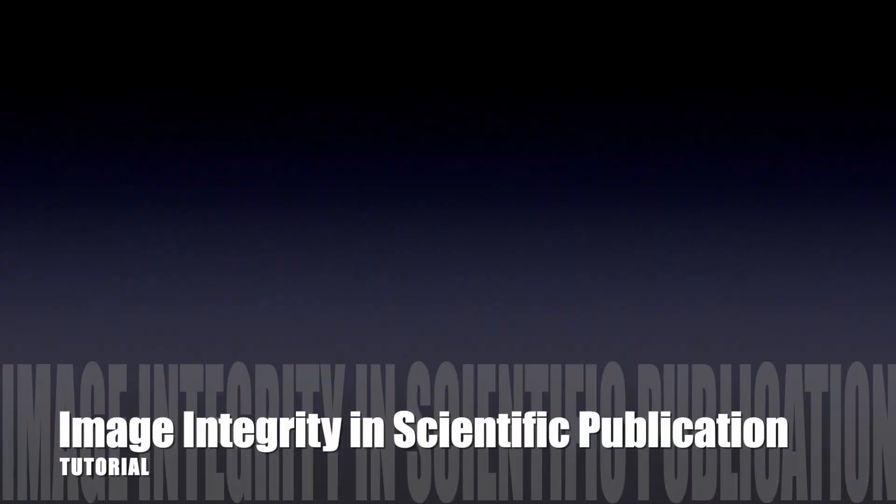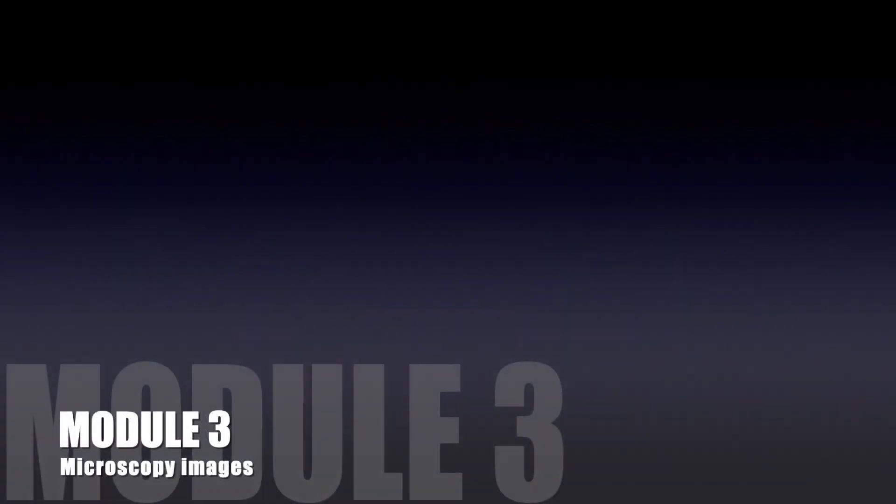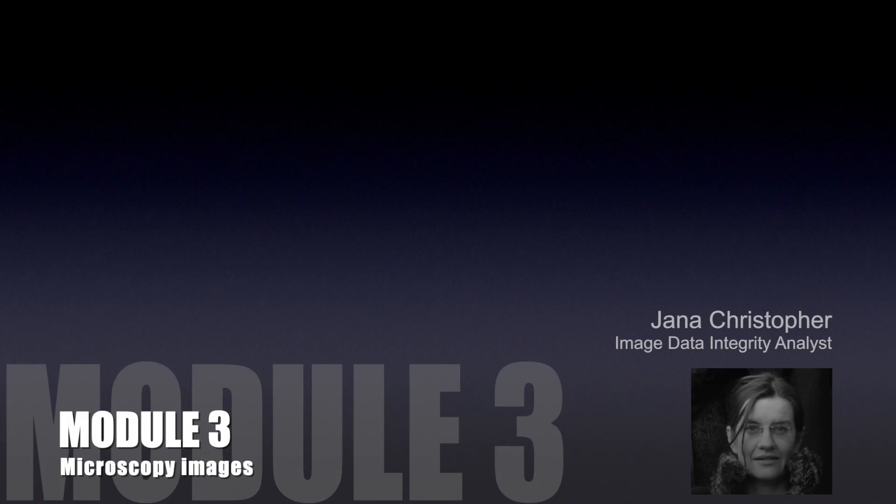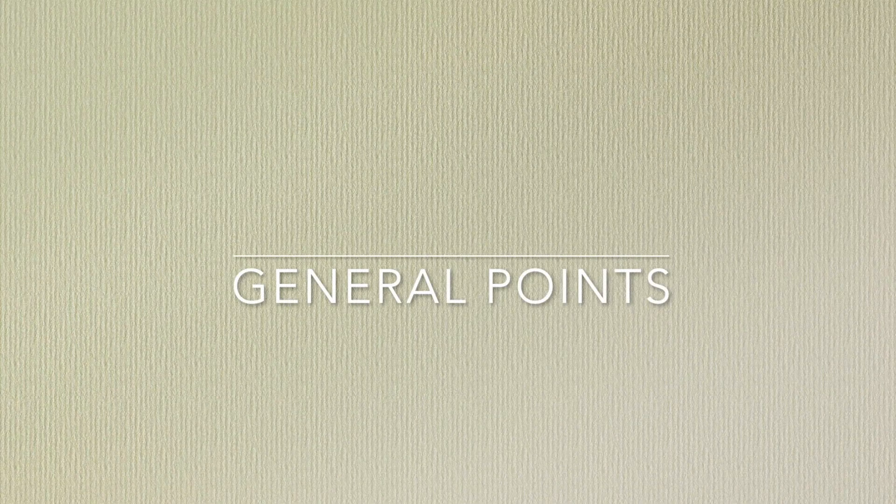Hello and welcome to part 3 of this tutorial on image integrity. In this video we will focus specifically on microscopy images and we are going to look at some typical issues that you might regularly come across during your image screening routine.